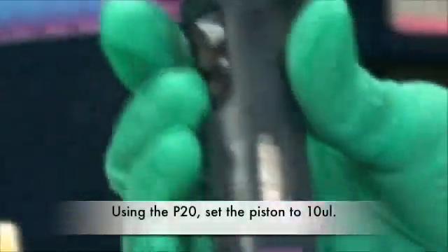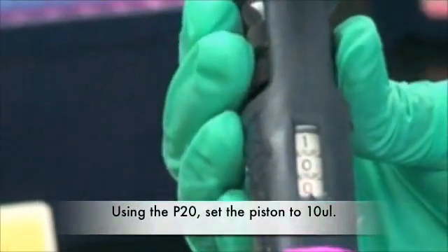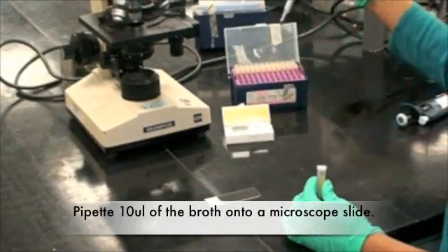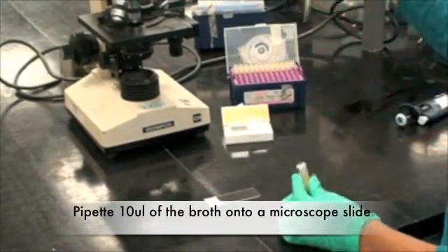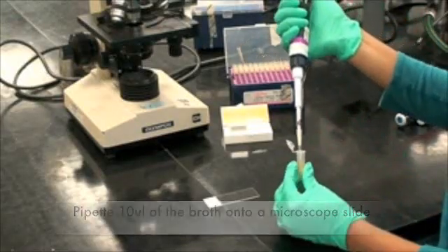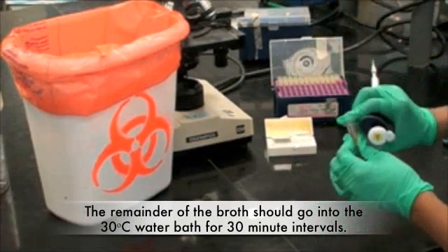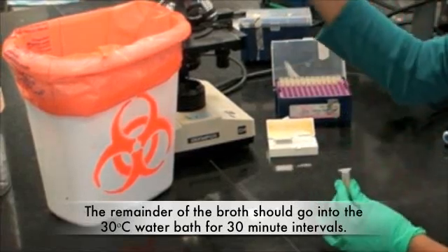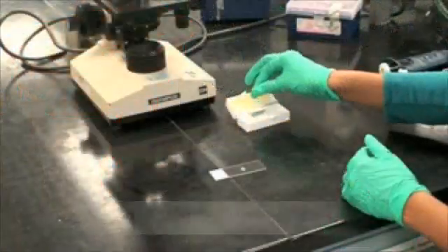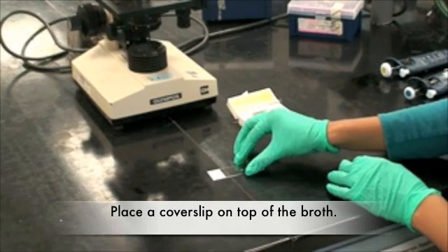Using the P20, set the piston to 10 microliters. Pipette 10 microliters of the broth onto a microscope slide. The remainder of the broth should go into the 30 degrees Celsius water bath for 30 minute intervals. Place a cover slip on top of the slide.